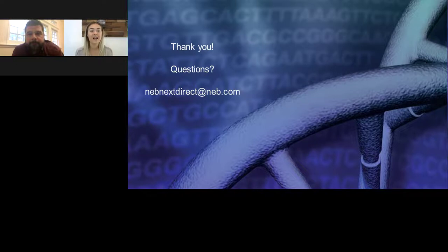Okay, our next question says, how much DNA can you get from FFPE? FFPE tissue, which we talked about a bunch, is a pretty common sample type for clinical workflows. Obviously it allows things to be preserved. The actual amount of DNA you get out of it can be highly variable, based on the biopsy itself and the amount of tissue that was embedded. It also depends on how it's being utilized, whether you're taking a section, how big that section is, or doing a punch where you're looking longitudinally through the section. It can be anywhere from a few nanograms, 10 nanograms of input, to several hundred nanograms if you have a whole block available. So it varies quite widely, but somewhere between 10 and 100 nanograms is typically what we see for DNA input coming out of FFPE tissue.